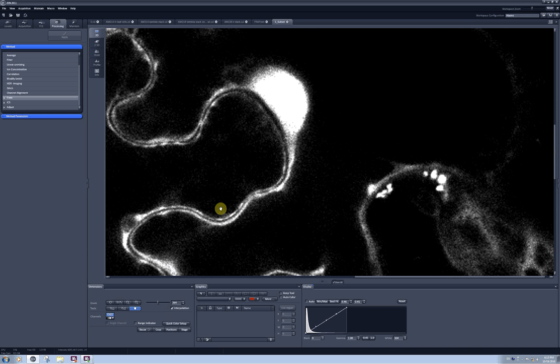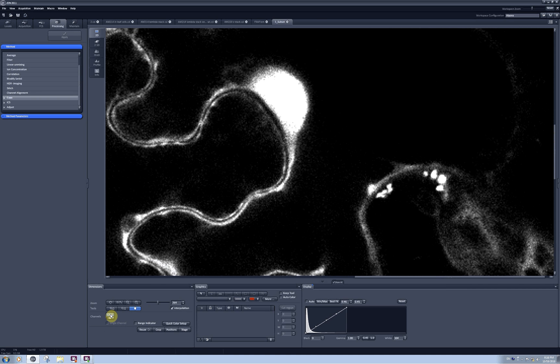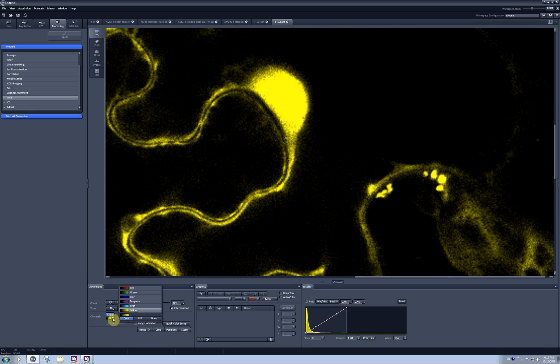Interpolation is used only to visualize your image. When checked, the software interpolates intensities of the neighboring pixels, which smooths out and slightly blurs your image — again, it doesn't change your raw data. You can select or deselect the channels you want to see; they are not erased from your raw data file, they are just either shown or not shown. You can color code individual channels into any colors you want.